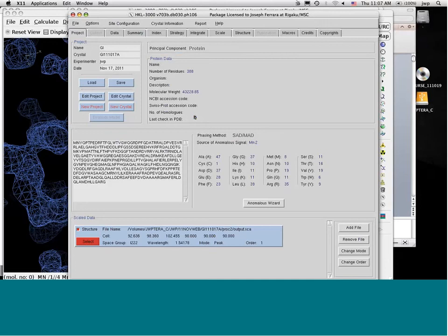I also believe that Phenix will do the same thing. Phenix, in my opinion, is not quite the same as SHELXD. And what you might have to do with your toolkit is use SHELXD with Phenix or with Phaser in the CCP4 interface, or HKL3000.